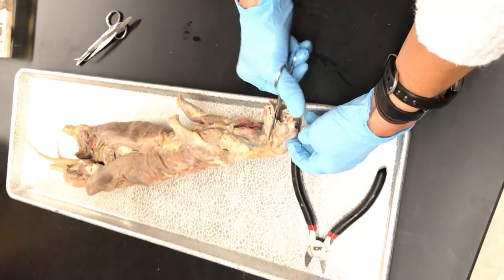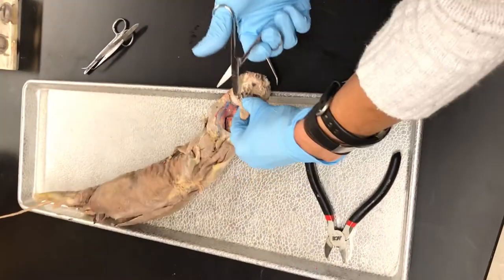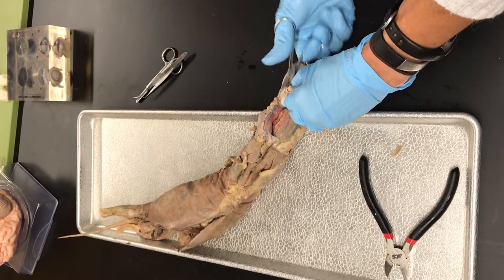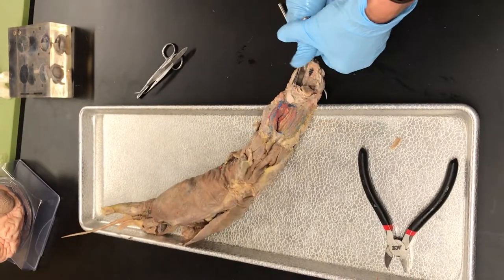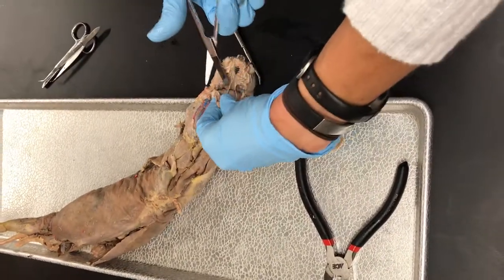You should hear something break; if you don't, keep trying. Once I've gotten that mandible broken, you can use scissors - the scissors aren't the best too, it's a combination.